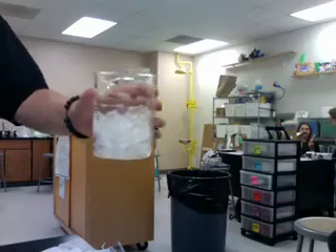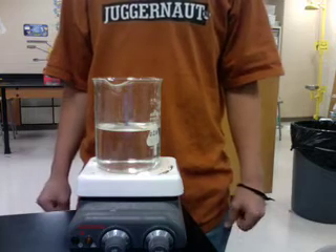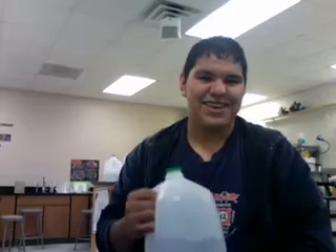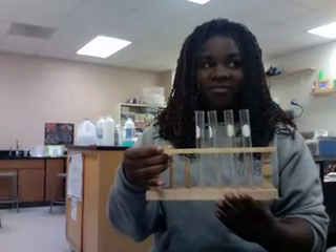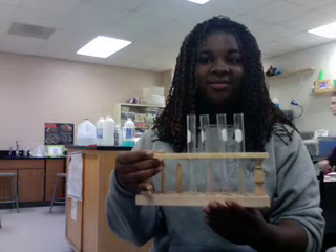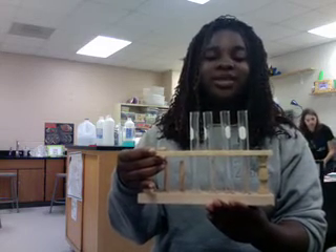This is ice. If your variable is high temperature, then a hot water bath will be needed. This is distilled water with a pH of 7, possibly. This is a test tube rack — it is used to hold the beans and the bromothymol blue solution.